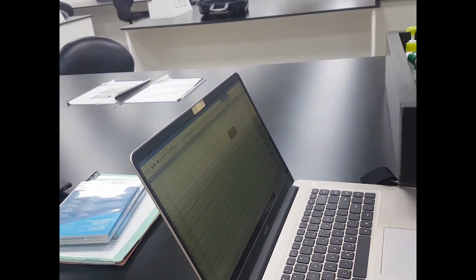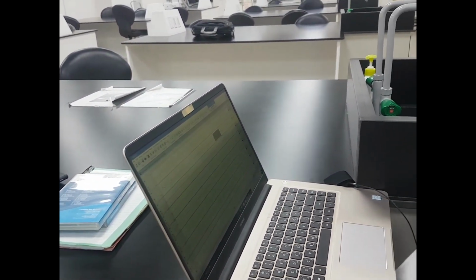At this particular moment it is 83, at this particular moment still 83. Here 85. Here 86. 91. 90. You understand what is happening here? How can we determine the exact start point? That the program itself is doing.